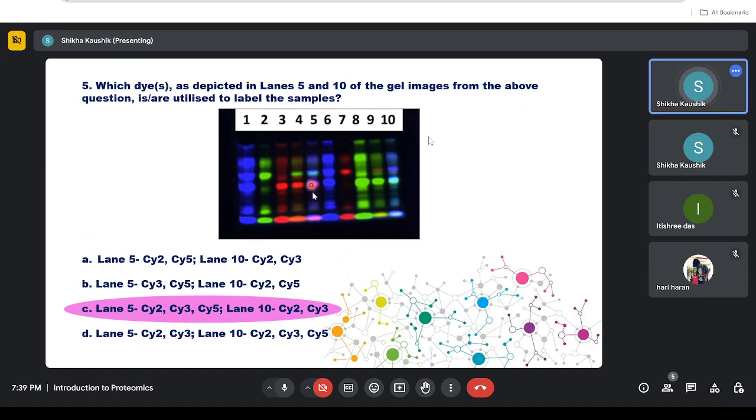So all the three are present, or I would say it's turning a little white. सो तीन का इफेक्ट वाइट ही है, बट बिकॉज ये पर्टिकुलर प्रोटीन तीनों में प्रेजेंट होगा, दैट्स वाई ये वाला बैंड थोड़ा सा वाइट है, बाकी ये वाला पर्पल है. दैट मीन्स ये रेड, ये बेसिकली आपके ट्यूमर सैंपल में ज्यादा प्रेजेंट है ये वाला प्रोटीन. सो दैट्स हाउ यू गेट टू नो दिस थिंग. सो आंसर हियर इज सी.